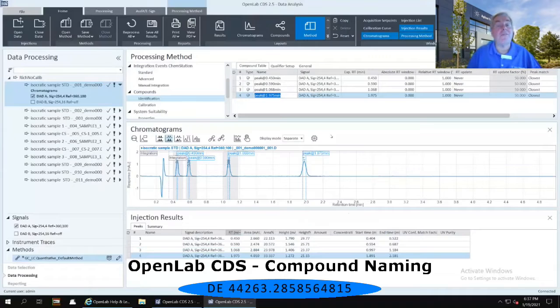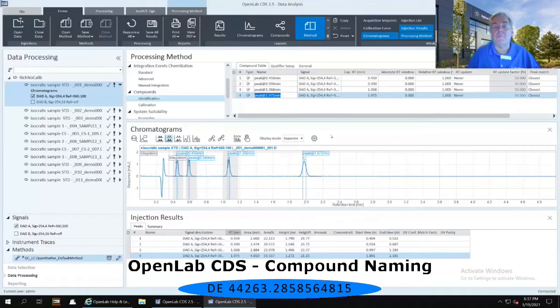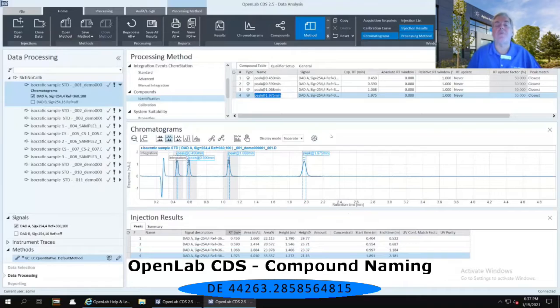Now, by default, it's going to label them with their retention times. So it has peak at 0.45 minutes, peak at 0.59 minutes, etc.